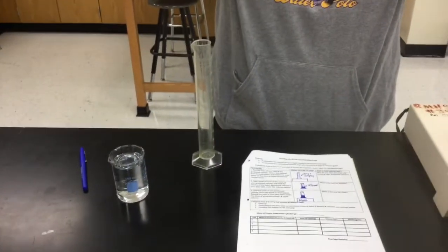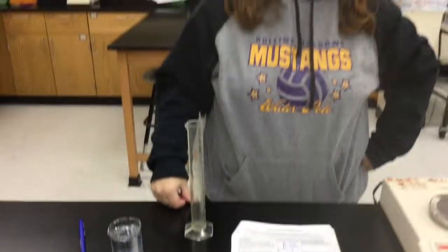Wow! And do I need my goggles for this, Miss Mardorian? You know what? Looking at the materials we have, we're using a plastic graduated cylinder and water, no chemicals, and we're not using glassware or heating. So I'm going to say no, we don't need to.